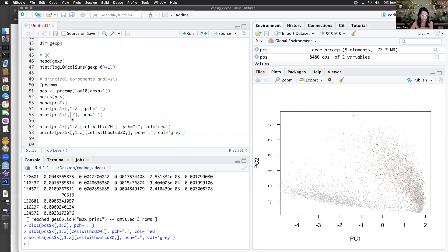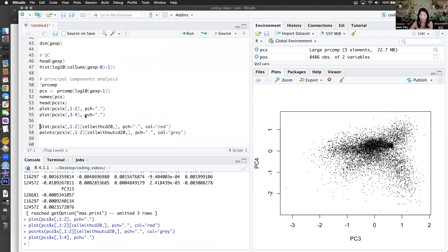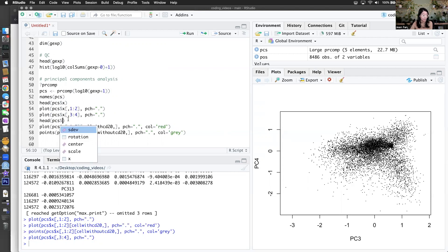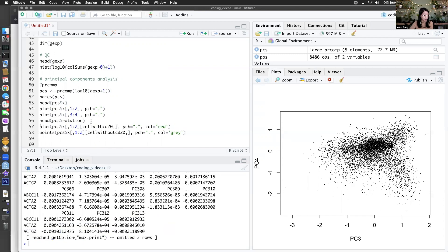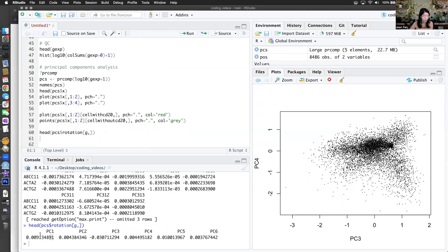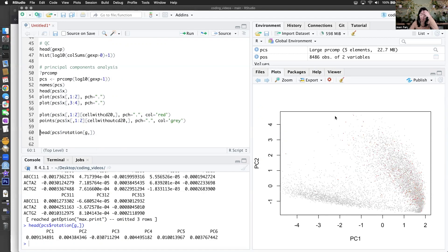How do the other principal components look? There are many principal components and they capture different axes of variation. I wonder what are the loading values of MS4A1 — it has a positive loading on PC1 and negative on PC3. I'll leave it to the students to explore what these primary axes of variation are, what they're capturing, and how they're splitting our cells into different transcriptional groups. There are a lot of PCs, and actually, how much variance do the PCs explain?